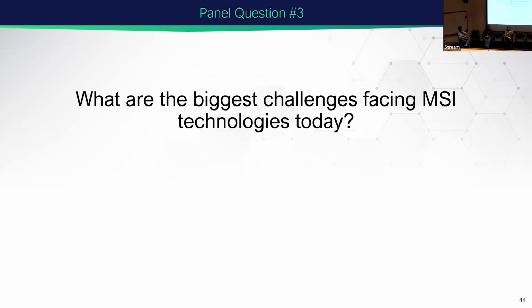If you have a community that's degrading lignocellulose, you can see what specific enzymes are being secreted by the fungus at a target point, and what metabolites are coming off of it. Maybe the bacteria in that local environment are taking up those metabolites, processing them into other things that are fed out to the system again.